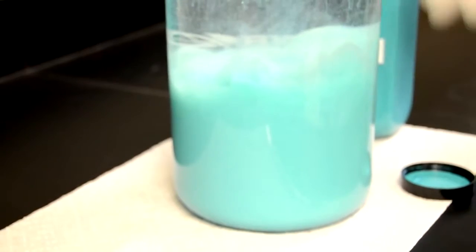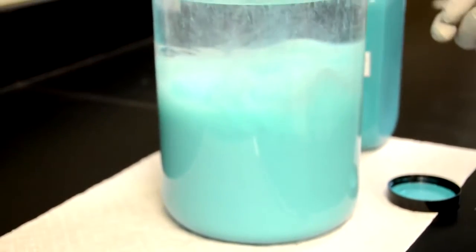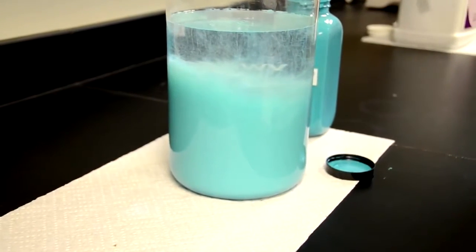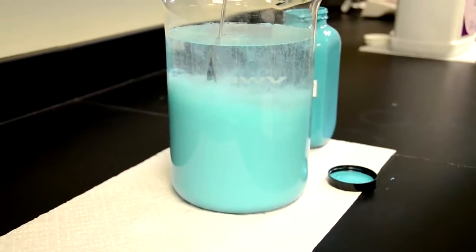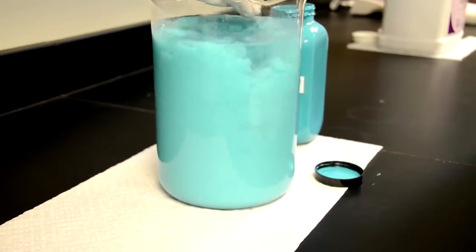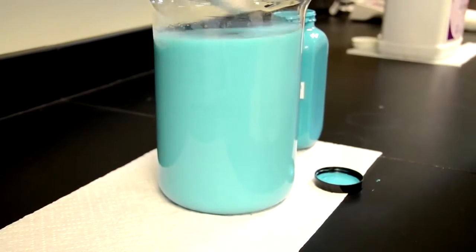But with use of additives, surfactants, dispersants, and polymers we're able to permit this formulation to disperse into water. So with general mixing the product quickly goes into dispersion.